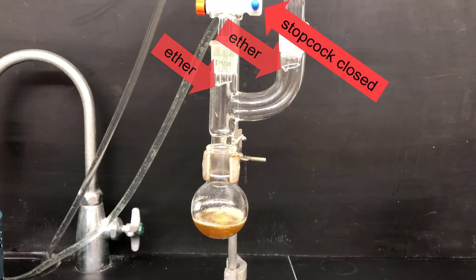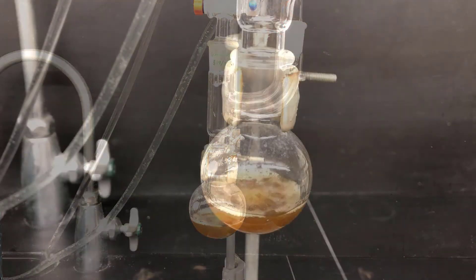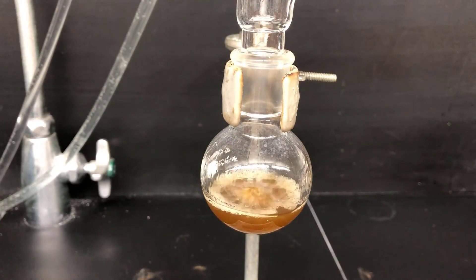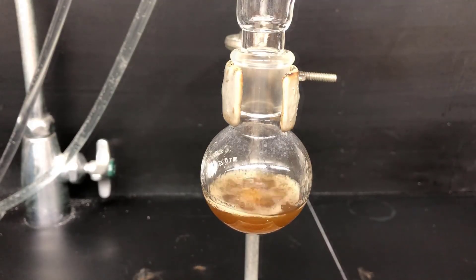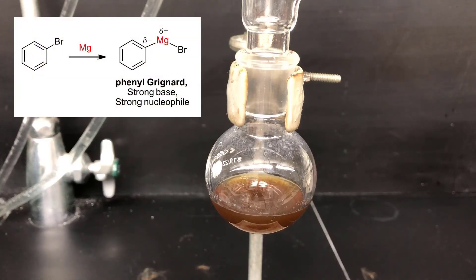Notice here I have the addition funnel stopcock closed. That keeps ether from escaping out of the apparatus. The reaction should boil for about 15 minutes under its own heat, and then the reaction will slow down, peter out, and look something like this. The formation of phenyl magnesium bromide is now complete.